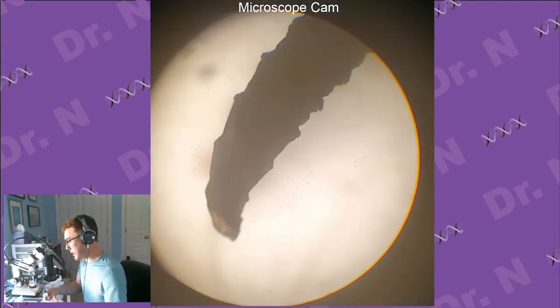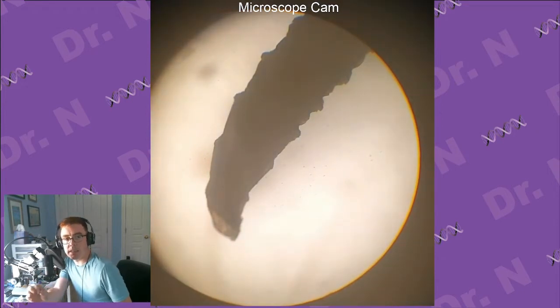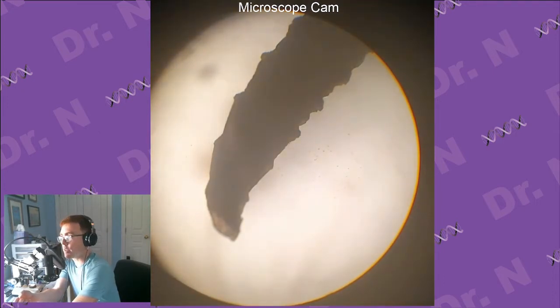So anyways, my plan is to take a couple shots at taking these guys, opening them up, and grabbing out a special organ called the salivary gland. These guys end up turning into pupa at some point during their development. Their salivary glands fill up with a sticky goo, and that's what they spit out so they can adhere to surfaces. So they can end up adhering to rocks or plants, or in the lab, they'll adhere to the sides of tubes.